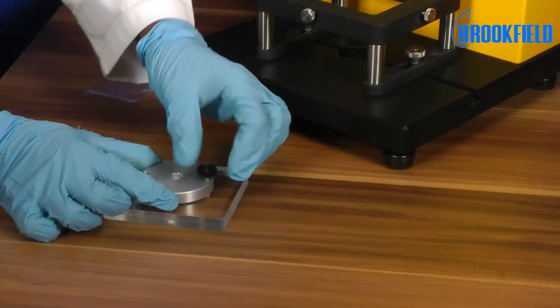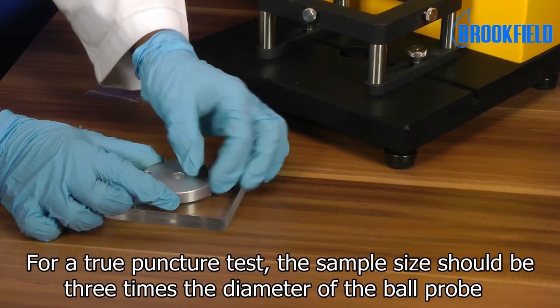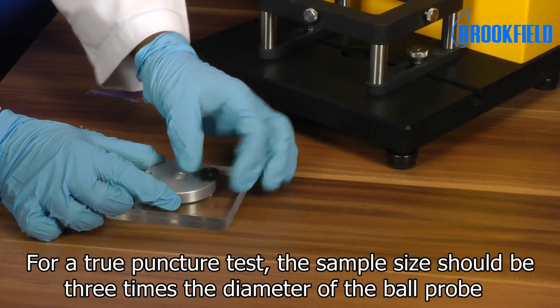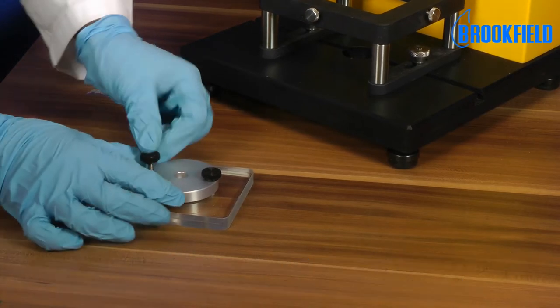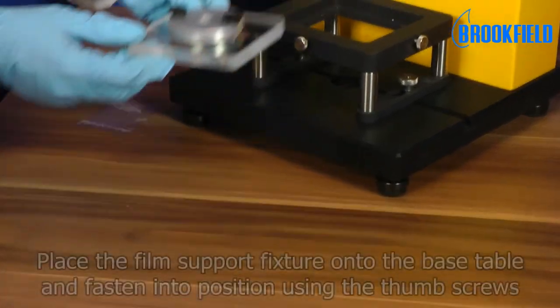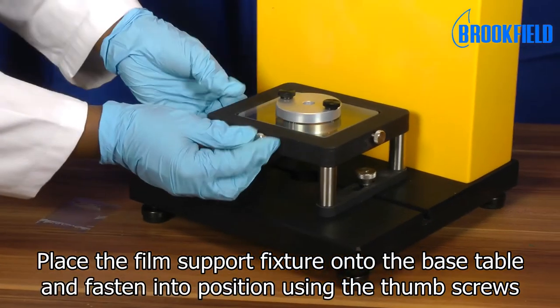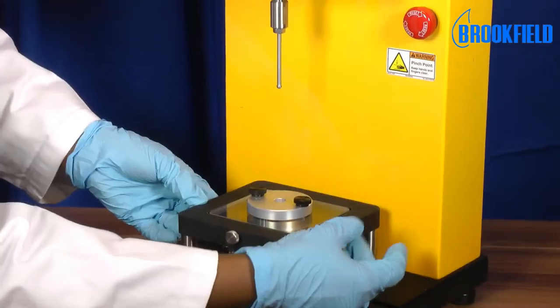Please note that the sample size is very important for a puncture test. For a true puncture test, the sample size should be three times the diameter of the ball probe. Place the film support fixture onto the base table and fasten into position using the thumb screws.